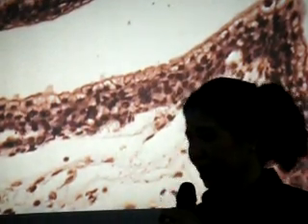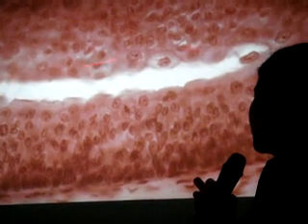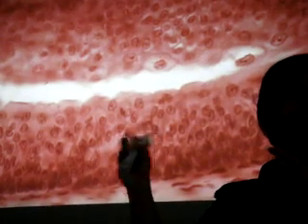Okay, look at the shape of the cells on the topmost layer. Ano yan? Classify pointed tissue, be specific. Transitional pa rin. Okay? Classify pointed tissue, be specific. Loose, okay, connective tissue. Nandyan yung basement membrane. Okay? This is actually a longitudinal section of your ureter. Okay? So, ganun din, no? Maganda. Okay? So, classify pointed tissue, transitional epithelium.